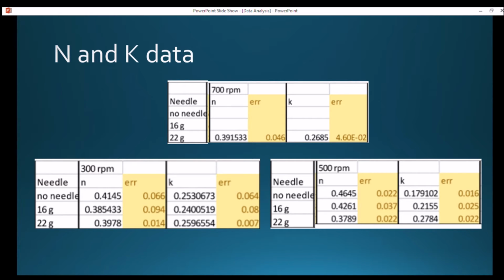We think that an error that could have happened in data collection is when you're dispensing beads, you're attempting to ensure that the beads don't drop on top of each other, but there's no way to make sure that this happens in reality. So if a bead were to drop on top of another bead, they essentially fuse together and change the surface area to volume ratio, which changes the diffusion rate.